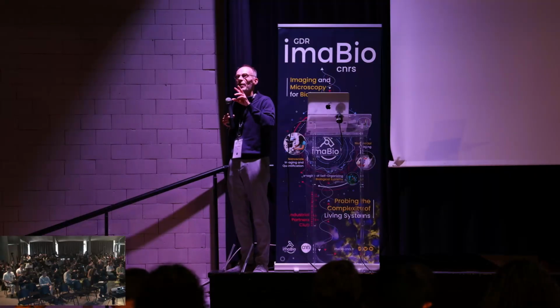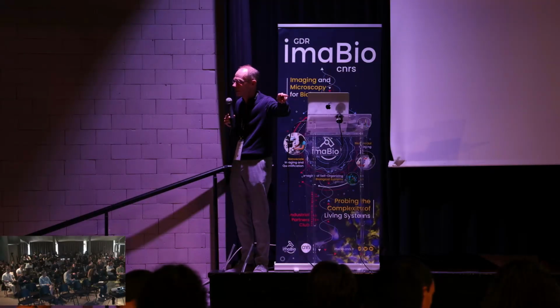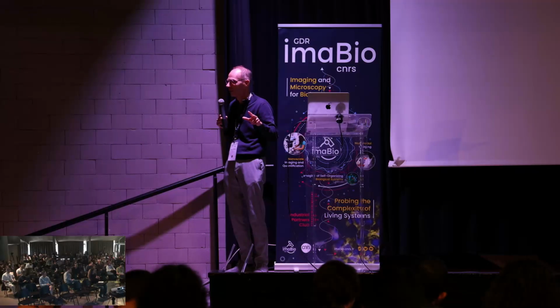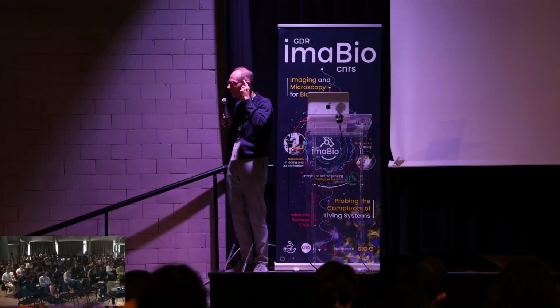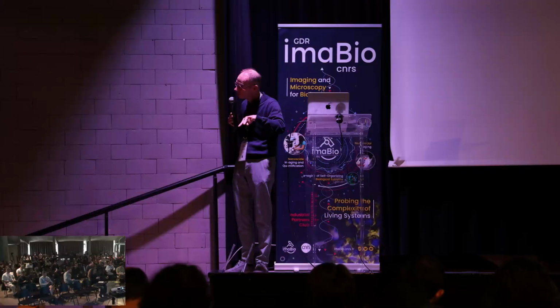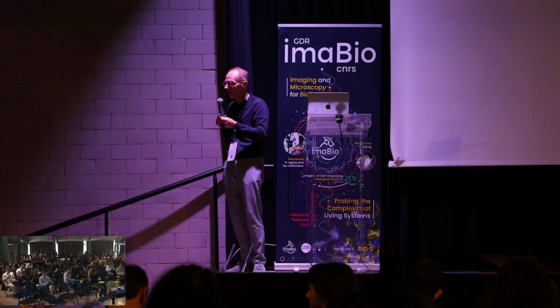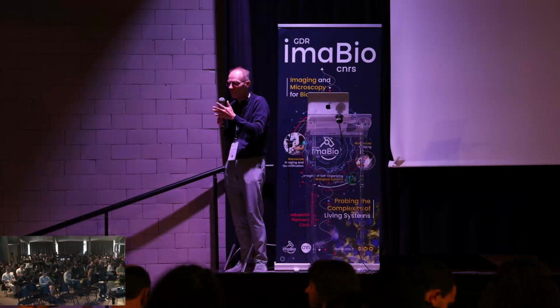actually we performed this technique. We compared the outputs of the two experts, and the consensus was 30% was okay for each one. It means that maybe an expert does not label the events similarly to the others. They are not from the same group. Maybe if you are in the same group, you label the events similarly, but from different groups, probably it could be different. So it's an open question.